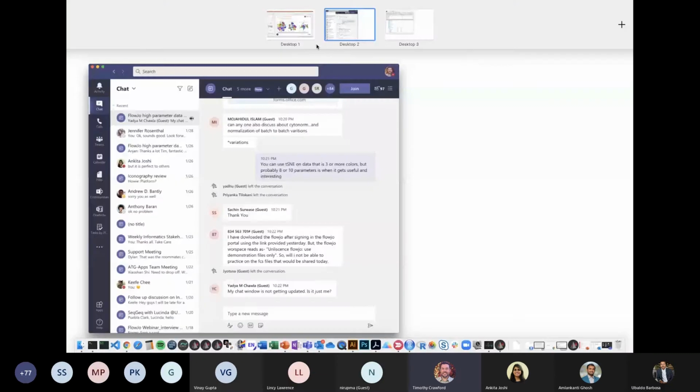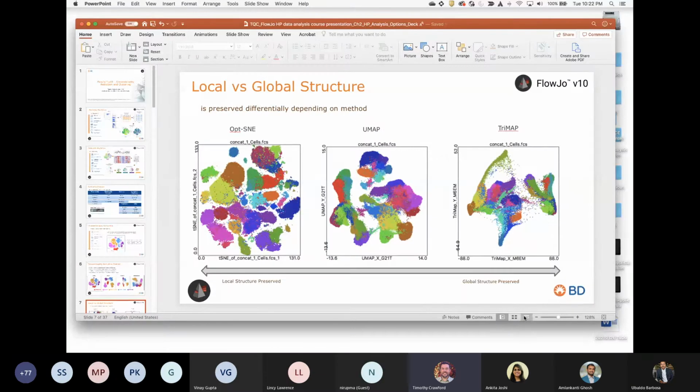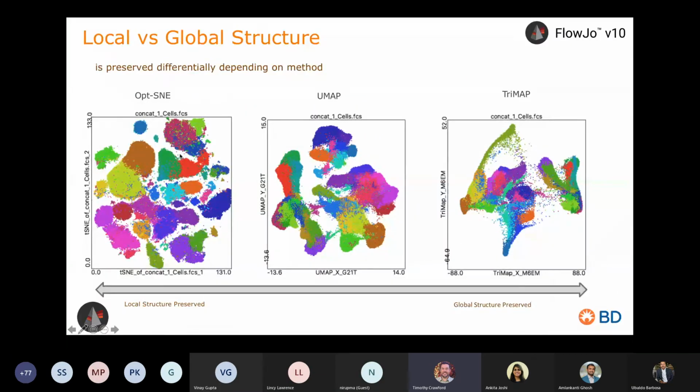And I don't have a slide for those, but I can talk about them and give you an example. So let me start by sharing my screen here. Share screen, and there we go. So hopefully you can see that. I'm going to go to my presentation. Can everyone see this presentation slide?